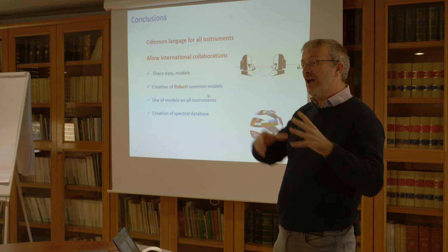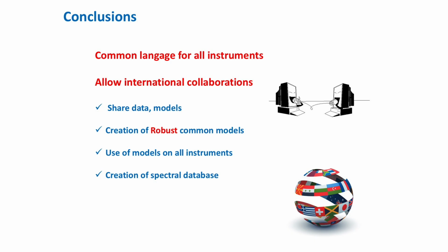In Belgium, we have used the standardization process since 2012 or 11, I don't know. And now we have a big database, and we are able to use it for the geneticist, because we are sure that the spectra of 10 years ago are the same as now. And we are able to predict some new models on spectra from a cow who is not still alive.